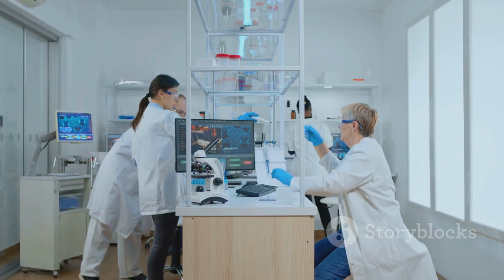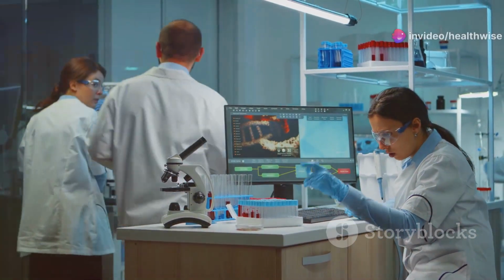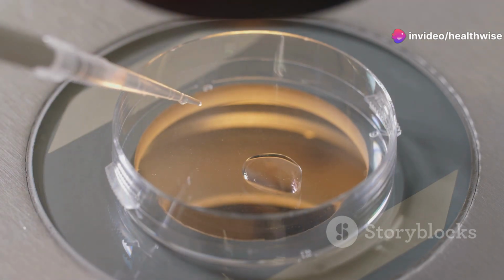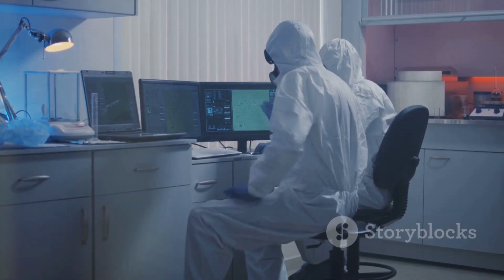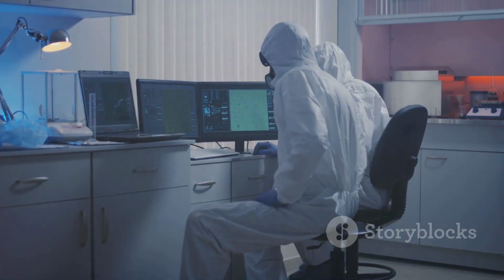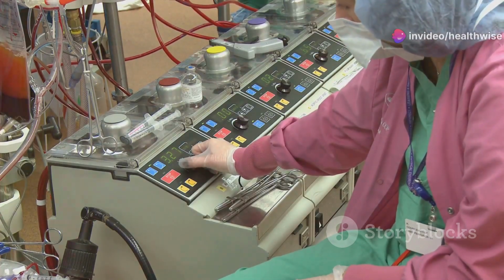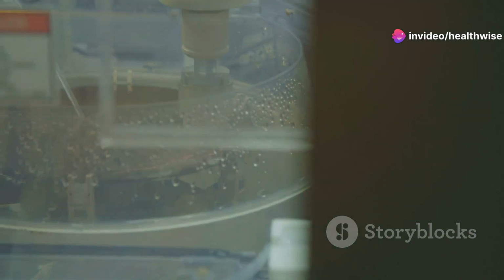Section 6. Conclusion. Incubators play a vital role in scientific research and medical applications. They provide stable environments essential for the growth and maintenance of cultures, cells, and tissues. Without incubators, many scientific advancements would not be possible. Regular maintenance and careful use are crucial to ensure incubators function optimally. This involves cleaning, calibration, and inspections.